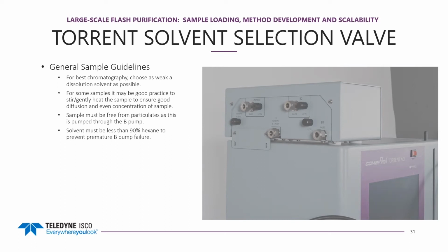For some samples, it may be good practice to stir and gently heat the sample to ensure that you have good diffusion and an even concentration of your sample, depending on how your sample dissolves.